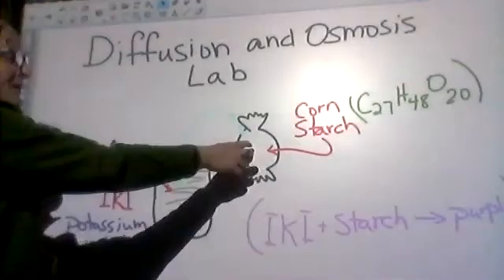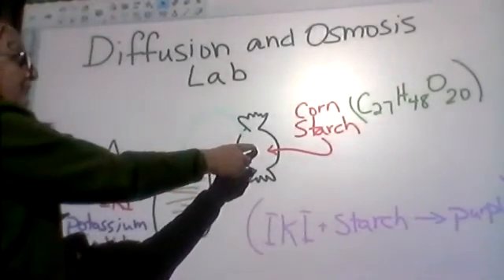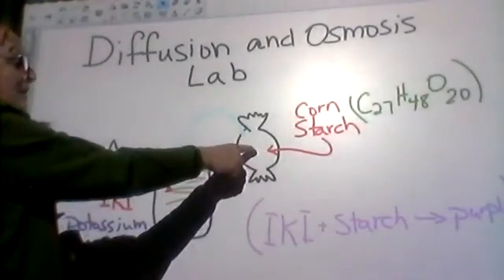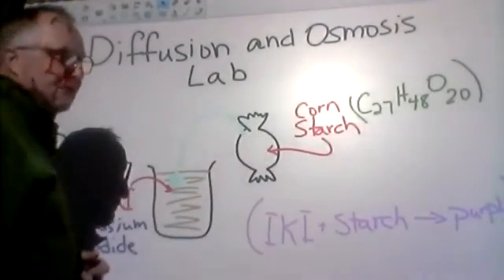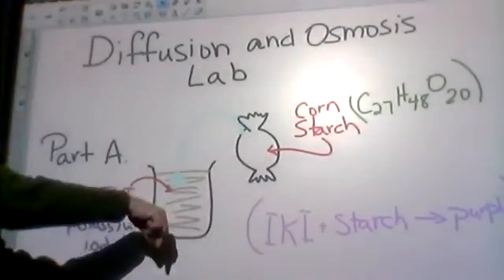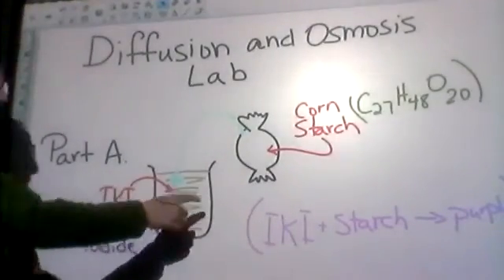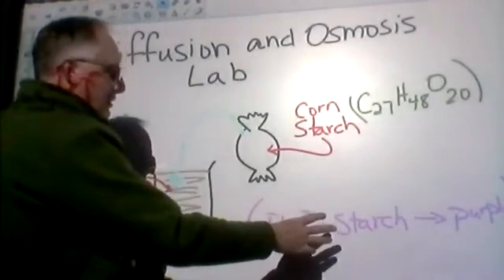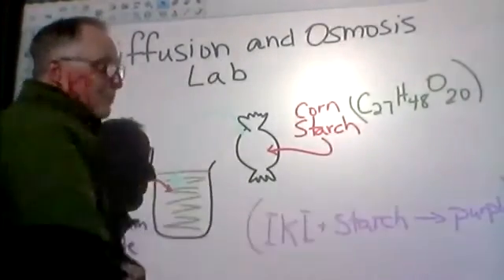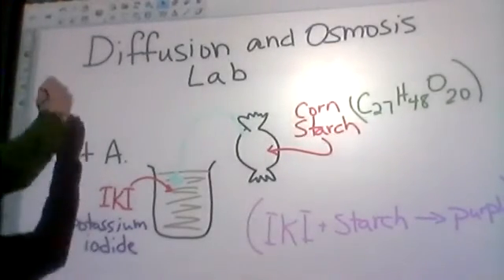When they put it in, it was kind of translucent, kind of cloudy. It wasn't really clear, it wasn't transparent, but it didn't really have a color to it. And this was kind of beer colored. And when you put them together, if you actually just mix them, you would get a purple color that would actually look like black. So you can tell where they have mixed.